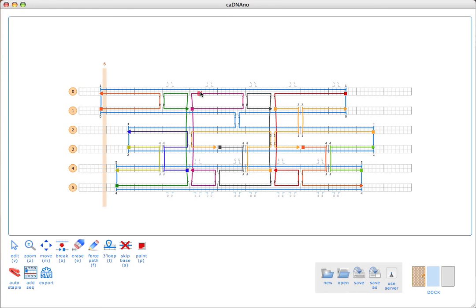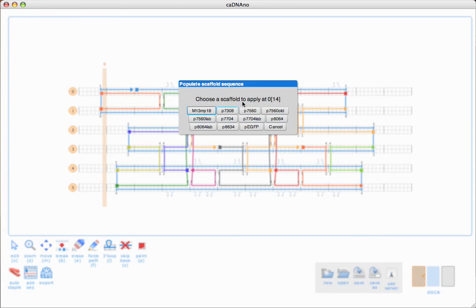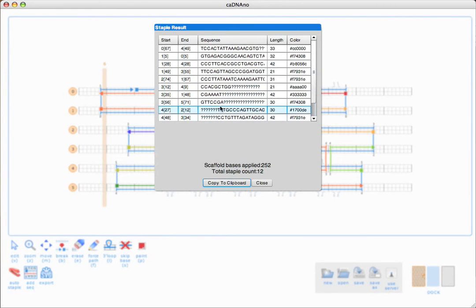You'll notice that clicking here doesn't do anything — we actually have to create a breakpoint. So I'll just create a break right here. The add sequence tool actually only works on a five prime end. So I click, I get some choices of what scaffold I want to use. I'll just use the regular M13 scaffold, and then we get the resulting staple list.